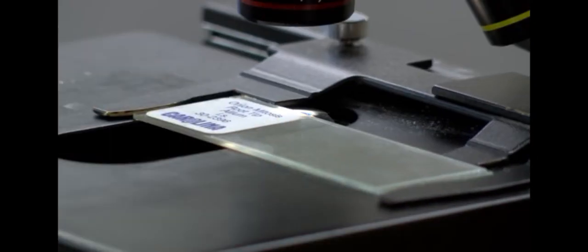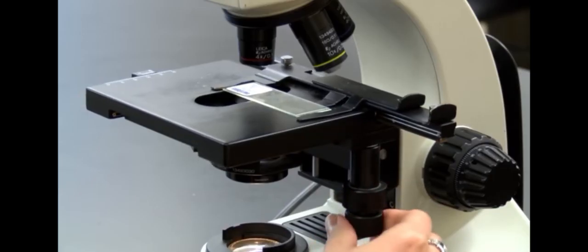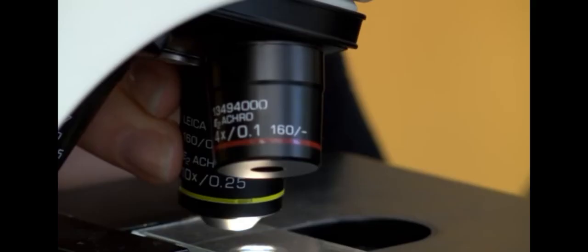Six. Move the microscope condenser by means of the condenser rack and pinion knob until the top of the condenser is approximately the thickness of a piece of paper beneath the slide.